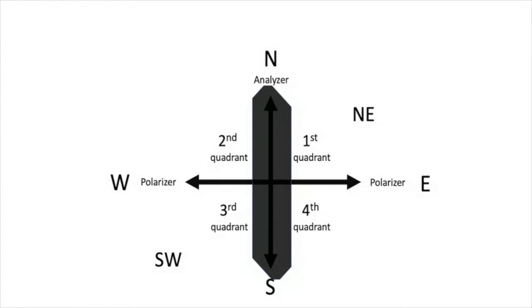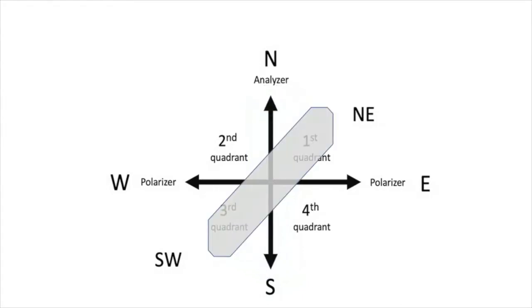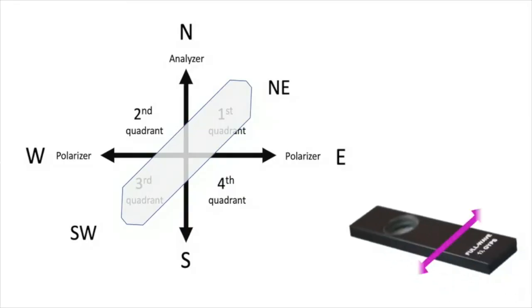Why? When a rhombohedral unit crystal is rotated to be at maximum brightness, it has a retardation that normally corresponds to the first order white, let's say equal to 200 nanometers. In this position, it has its special planes, the optical plane and the normal equatorial plane, at 45 degrees from the polarizer or analyzer. But which is which? Or, in other words, where is the ordinary ray plane and where is the extraordinary plane orientation? To know that, we need to insert the gypsum plate.